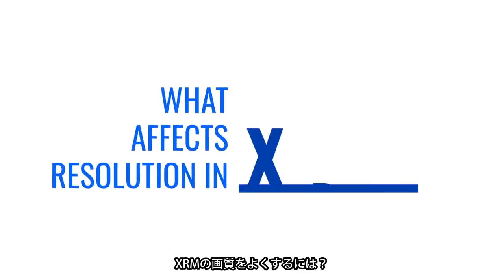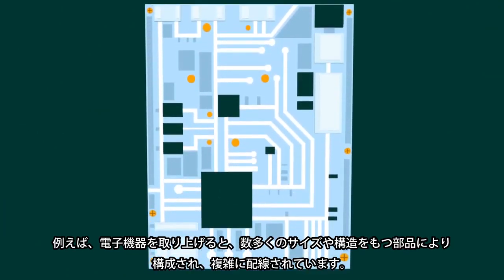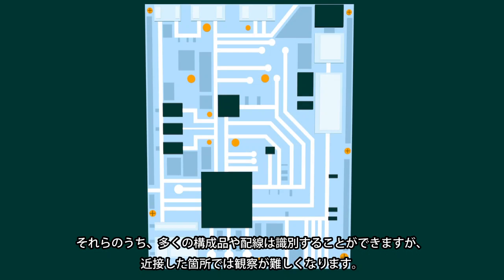What affects resolution in XRM? Resolution in microscopy is defined as the ability to discern two separate objects. For example, electronic devices contain many components connected by traces with a large variety of size. Many of the components and traces can be distinguished, but a few of them are a bit too close.